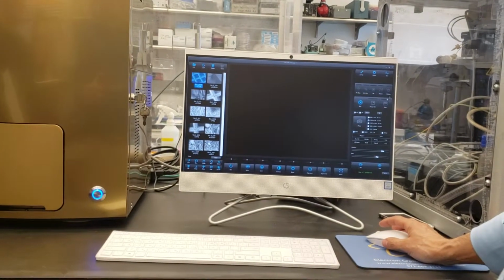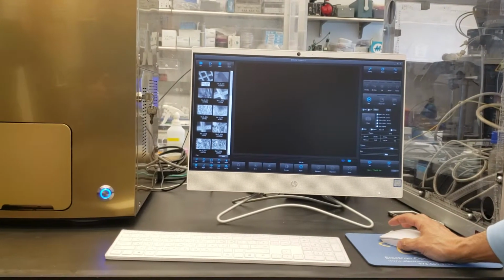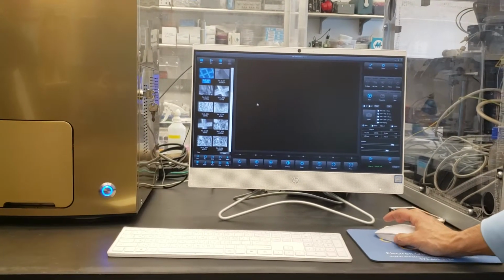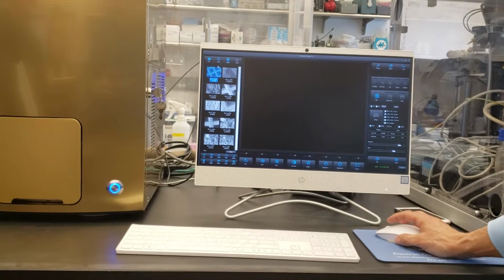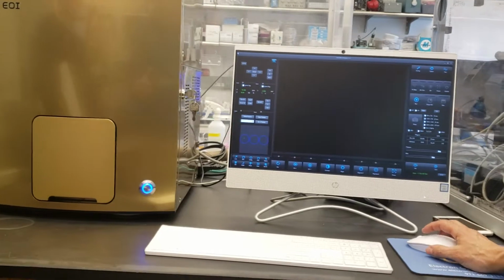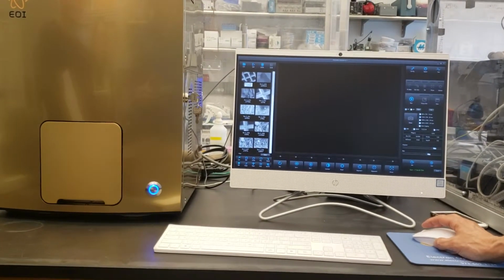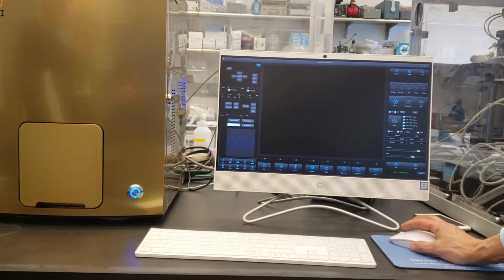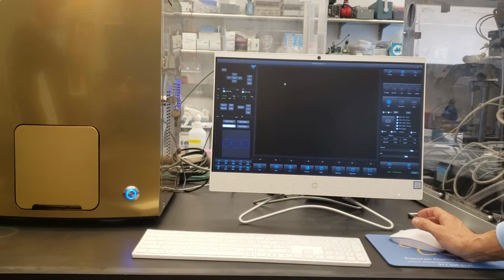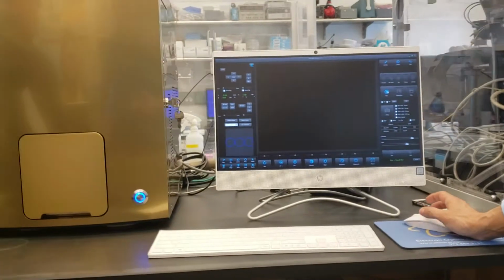You can access these features, but realistically, it's not doing anything, right? And so here are pictures that it's remembered. So if I hover my mouse over the left-hand side, it changes to my stage program. And then if I click on these arrows, it changes back to the picture taking, right? So if I hover it there, it changes to the stage program. And so realistically, what it wants me to do is run. So I click on run, and it automatically will turn the beam on.